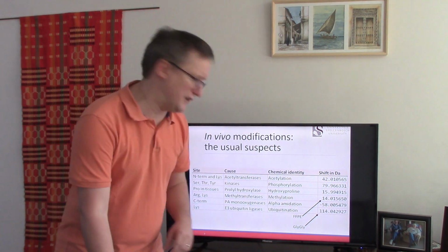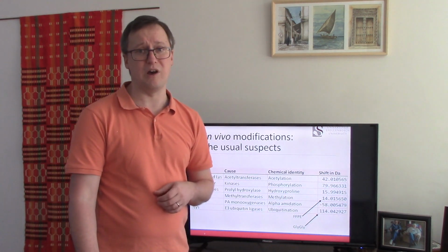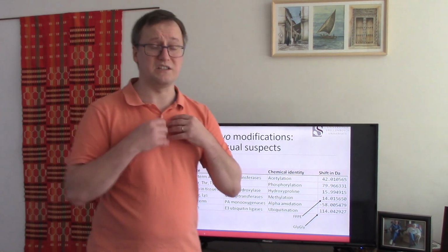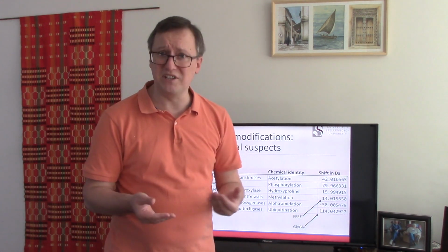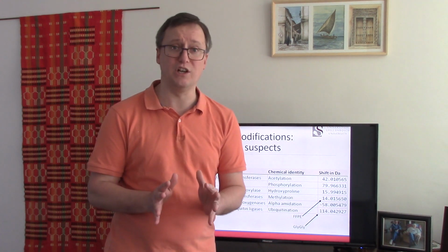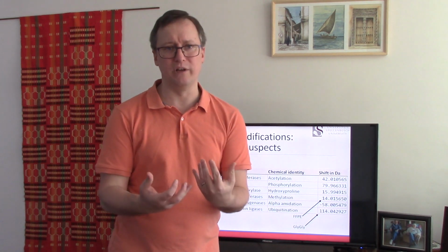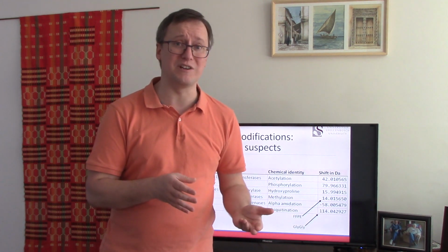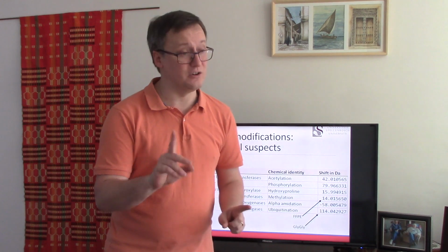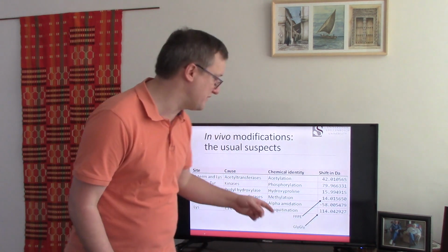Not going to talk again about phosphorylation, but hydroxyproline is definitely worth talking about. If you are dealing with solid tissues, like biopsies, it's quite likely that you have a large amount of collagen in your sample. And collagen is absolutely littered with hydroxyprolines. If you do not include that in your database search, you're not going to see it. So you better include hydroxyproline if you're doing solid samples of that sort.